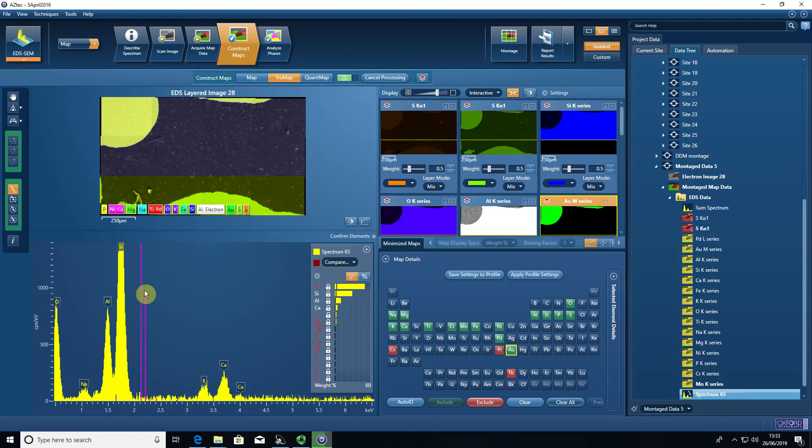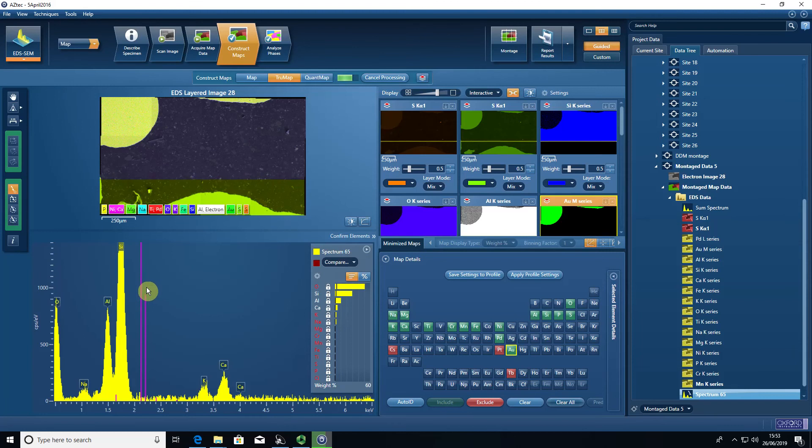So it's really important that you do this step before you do any other processing of element maps.